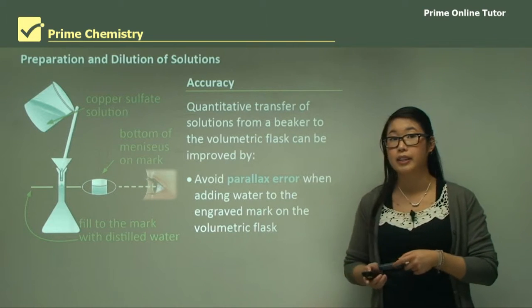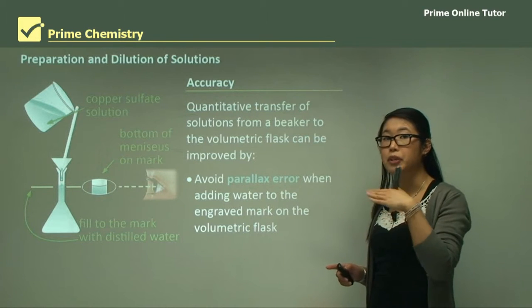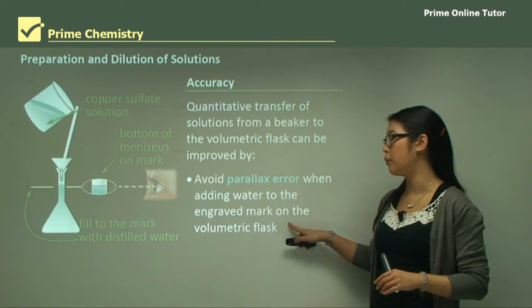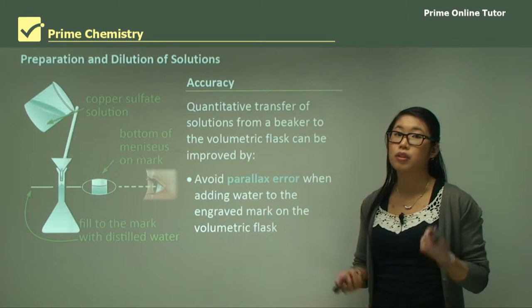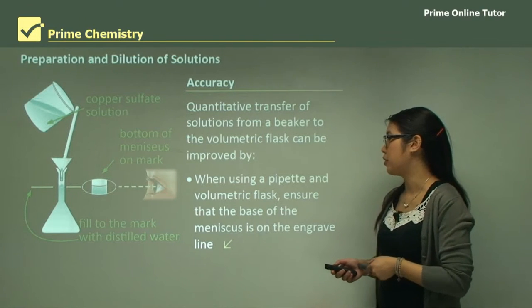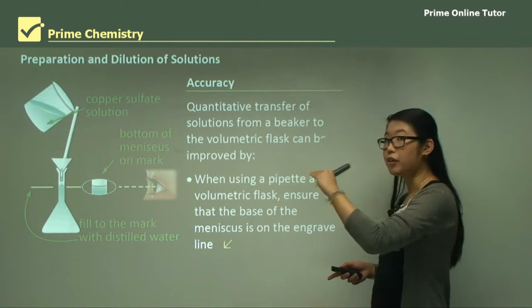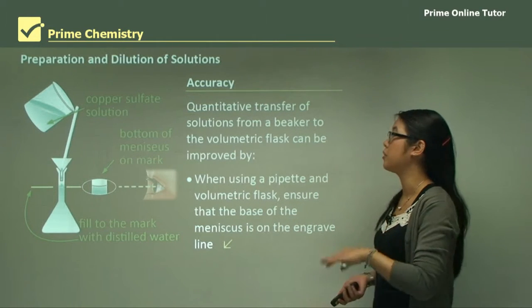We can also avoid parallax error when measuring volumes. We must look at the bottom of the meniscus, and that bottom of the meniscus needs to be in line with the engraved mark on the volumetric flask — if it's below, the target volume was not reached. When using a pipette or volumetric flask, always look straight across so the eye is level with the bottom of the meniscus on the line.